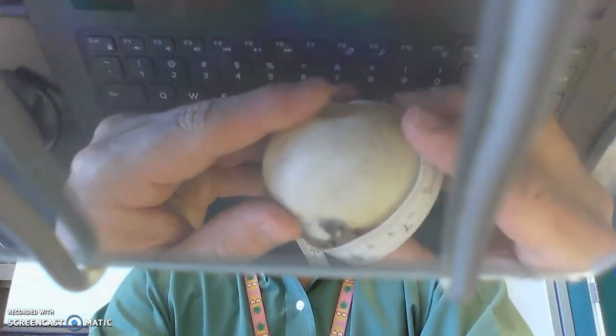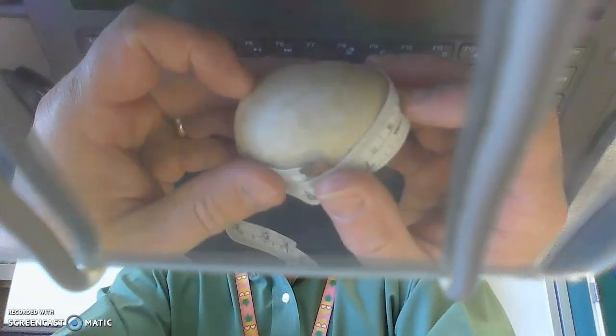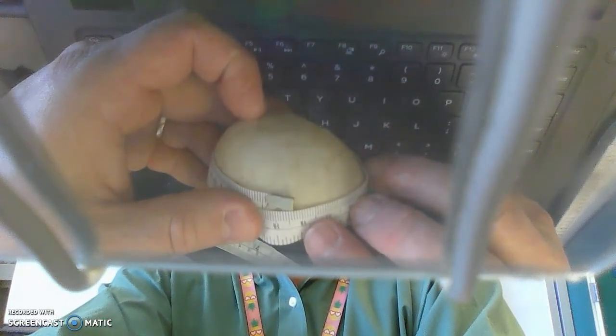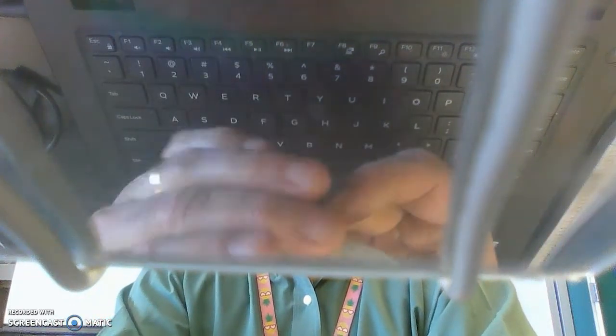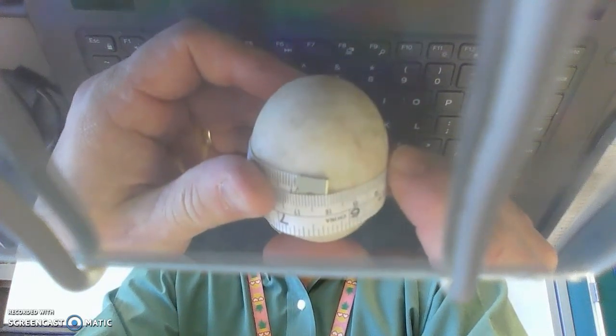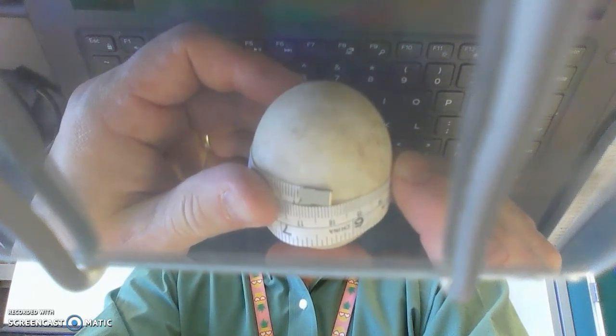You can see that the end of the measuring tape for the long circumference is right around 18.3 long circumference. And for the short circumference, the measuring tape is right around, you can see, 16 centimeters. 18.3 and 16 centimeters. So we've measured the mass of our egg and our circumference long and short and written those down. And now we're going to put the egg in the cup and we're going to cover it in vinegar. That's the first day.